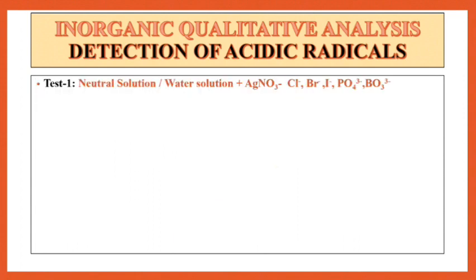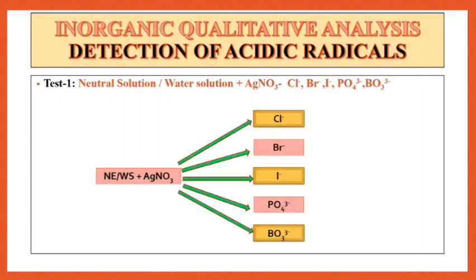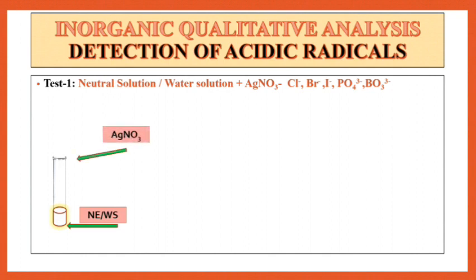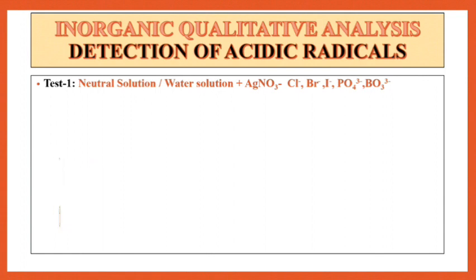The first test for the detection of acidic radicals is addition of HNO3 in neutral extract or in water solution. Then observe whether Cl⁻, Br⁻, I⁻, PO4³⁻, or BO3³⁻ is present. Take neutral extract or water solution. To this solution, add HNO3 drop wise. After addition of HNO3, check this solution well.